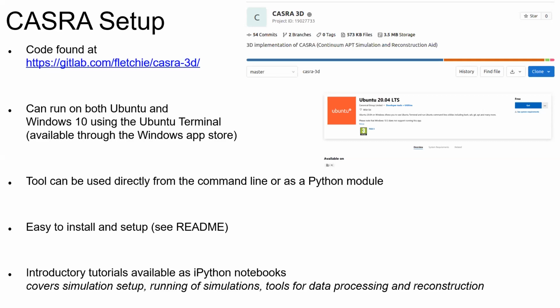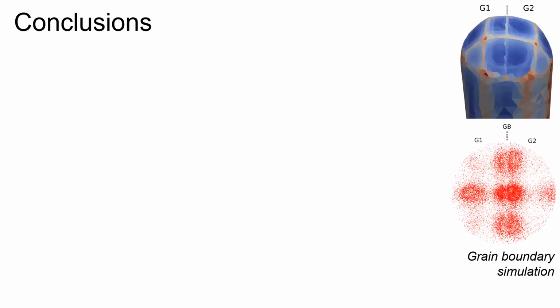And then introductory tutorials are also available as IPython notebooks on the repository. So these cover simulation setup, running of simulations, and tools for data processing and reconstruction.